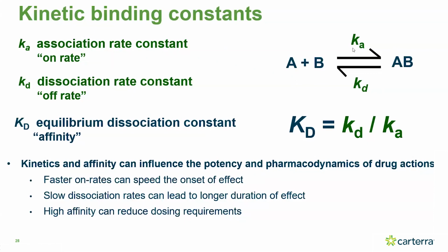And the dissociation is always occurring. Well, essentially they both are, but during a binding cycle, when we switch to running buffer after the association phase, the concentration goes to 0. So the ka term essentially drops out.